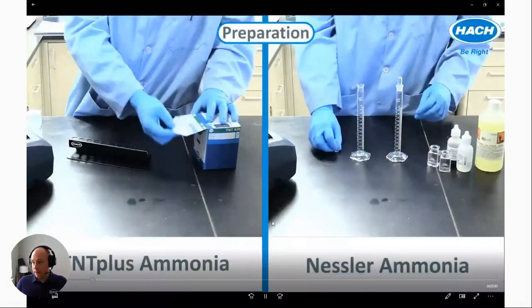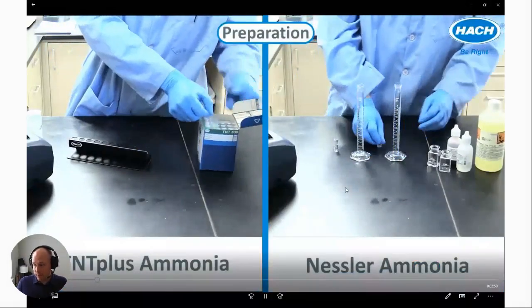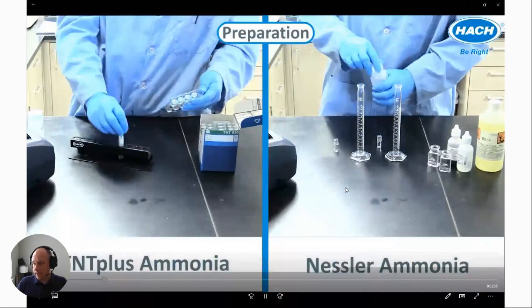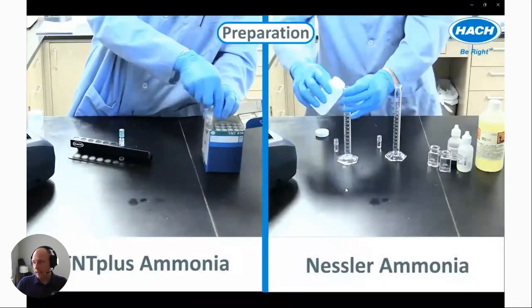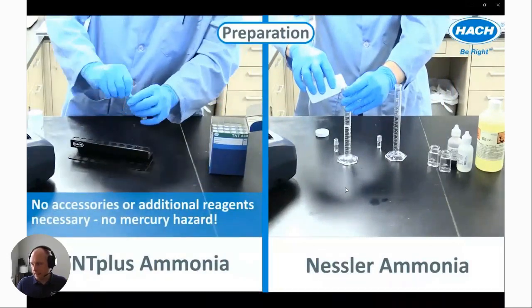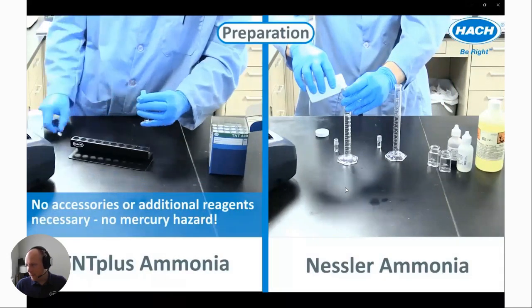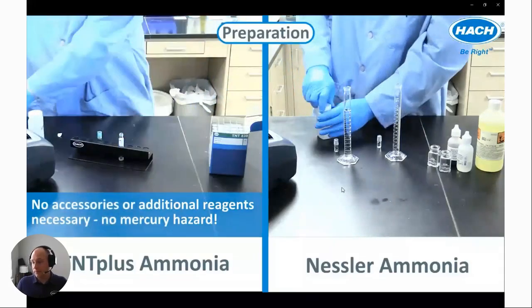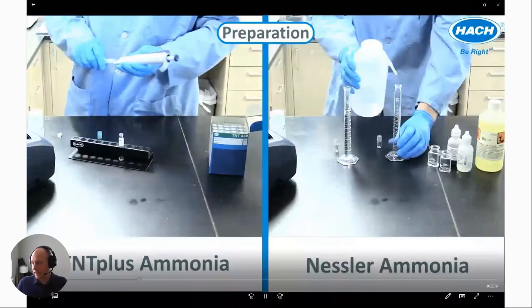All right. So on the right hand side, I'm getting my graduated cylinders ready, and I'm going to add blank to one of these guys and sample to another. And I've got to add exactly 25 milliliters here. That was a really good pour job on my part, I gotta say.